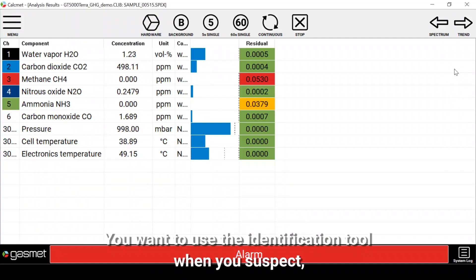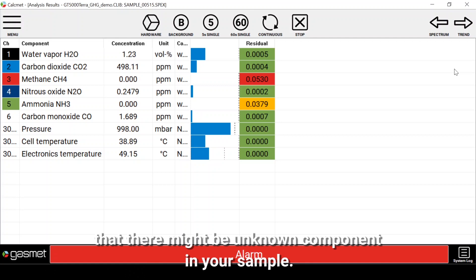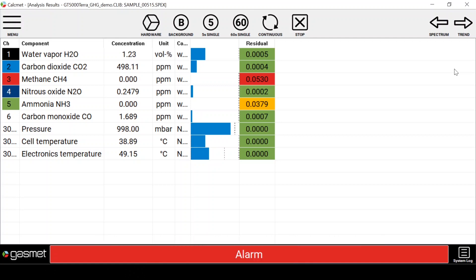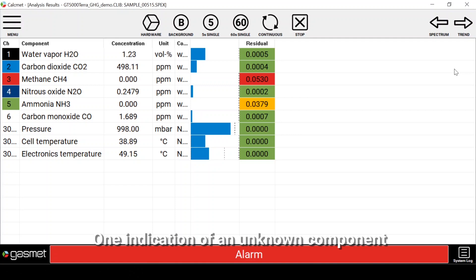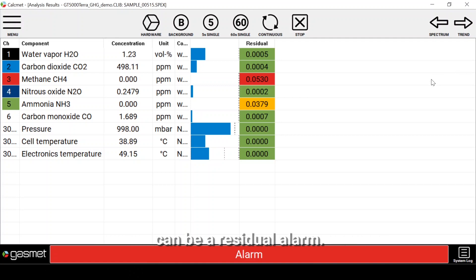You want to use the identification tool when you suspect that there might be an unknown component in your sample. One indication of an unknown component can be a residual alarm.